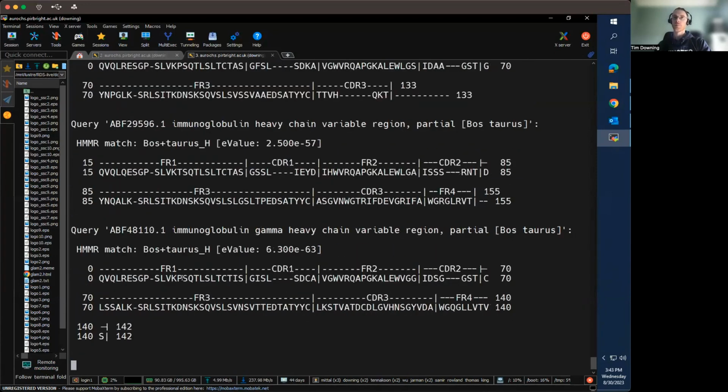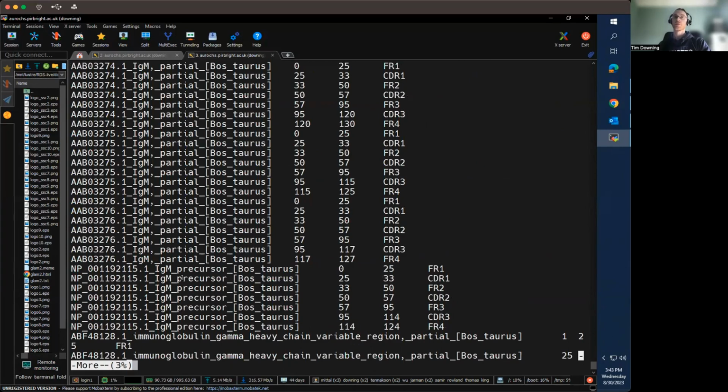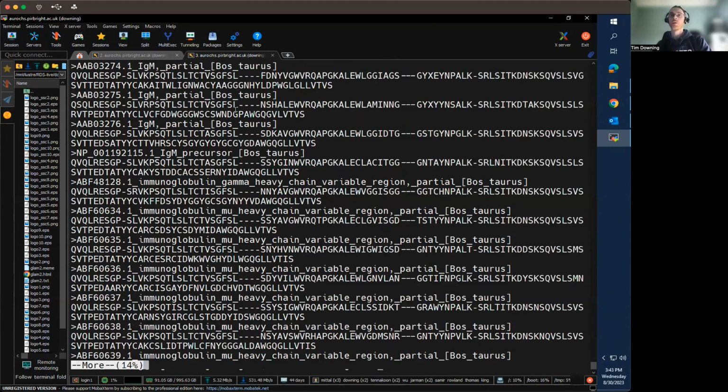And we see all the alignments being produced there. And now we can look at bos1.bed for each of the coordinates for each of the samples there in sequential format. So you can see the first one there is the first 7 lines and so on. And we can see the same for the alignments. We can look through them all as well too as we go along.